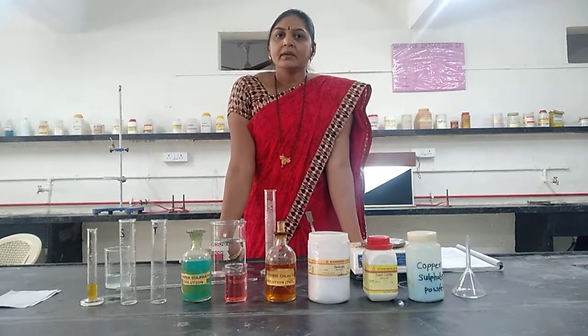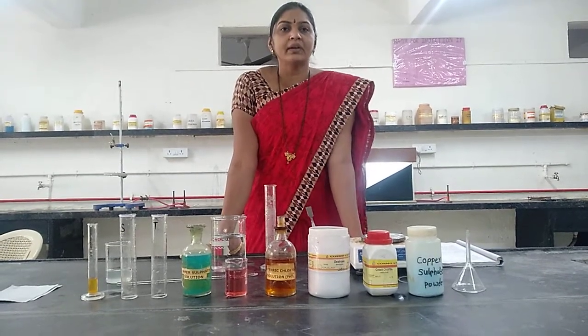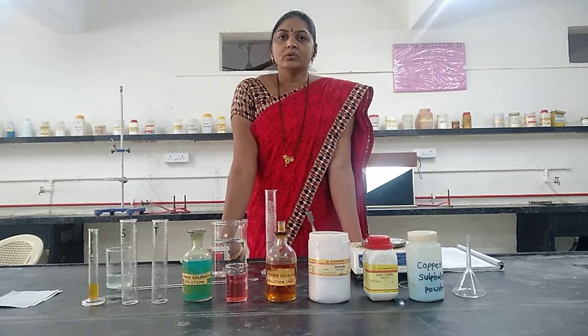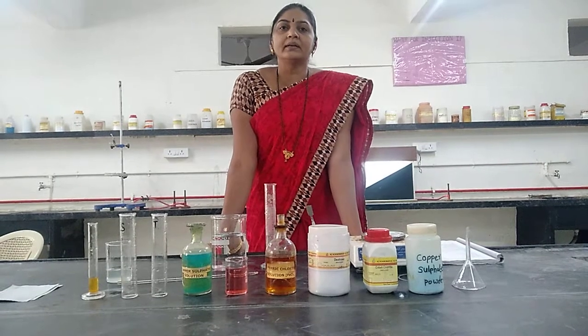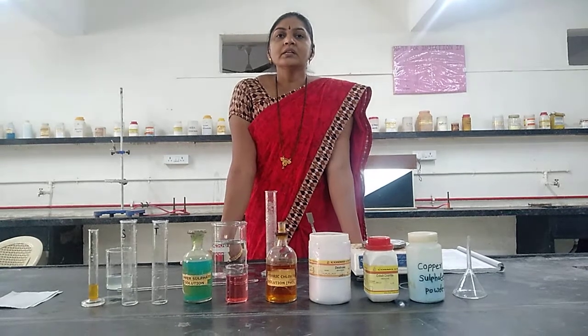And it is compared with the standard one, prepared using ferric chloride, cobalt chloride and copper sulfate solution. When the two solutions are kept inside the Nessler cylinders and observed under dark and white background, they will show the changes.